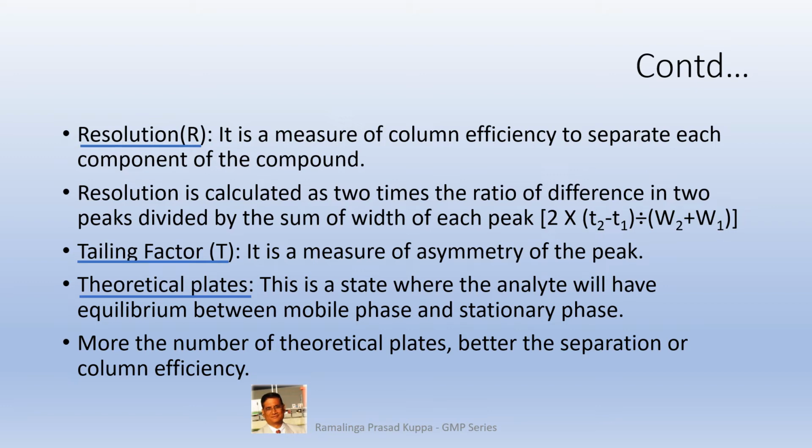It is calculated as 16 multiplied by square of the ratio of time and width. There is another calculation which the software provides. It is 5.54 multiplied by the square of ratio of time and width at half height.